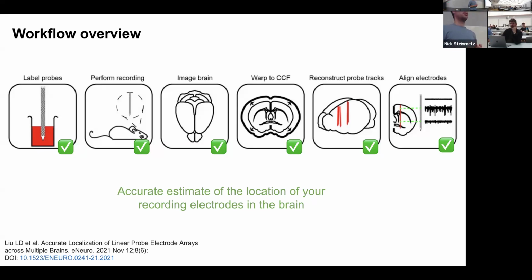So we switch into a channel map that covers a deeper depth along all 4 shanks, but at sparser coverage, and record a few minutes of that to help with the alignment step. Josh, I think you guys switch serially between different banks, record briefly at a bunch of them, and assemble that to help with alignment. Depending on your target brain region, you may not need that, but for some, it's useful.